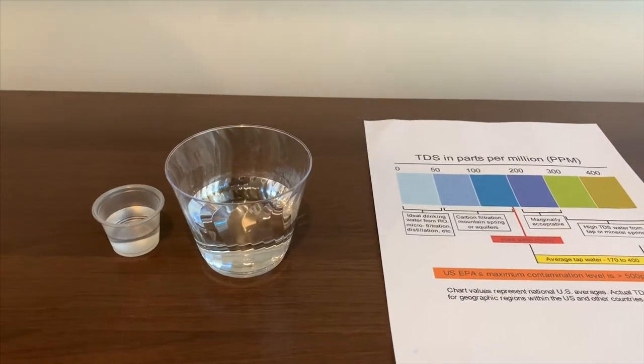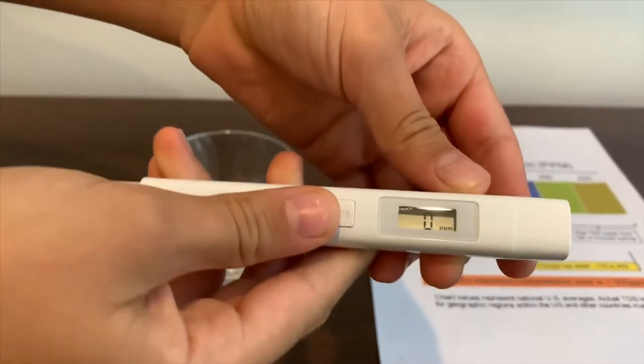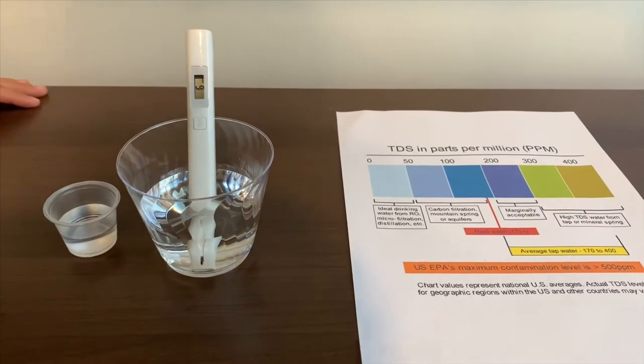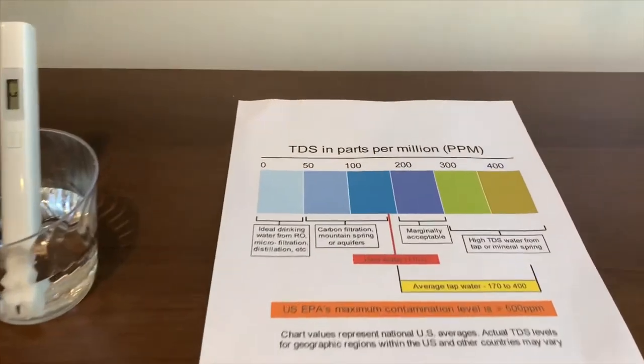Let's test the TDS level first. Turn on the TDS tester and make sure it says zero. Put it in — six. That is ideal drinking water.